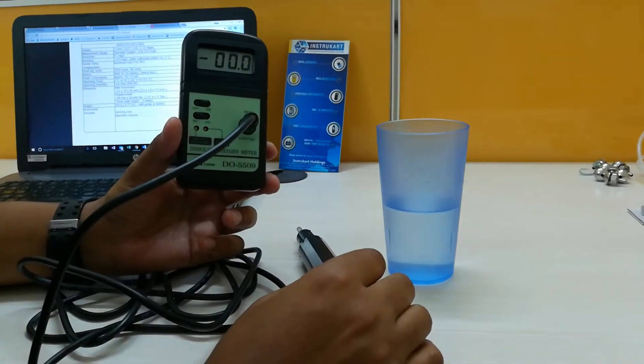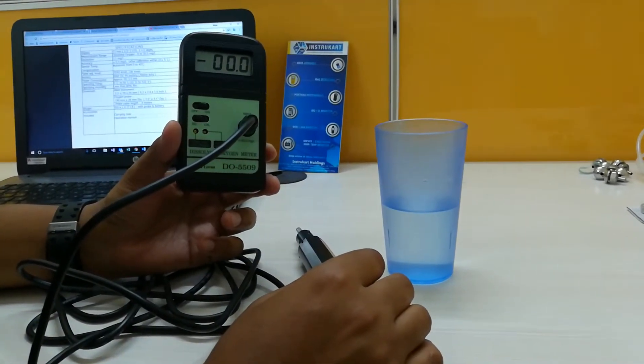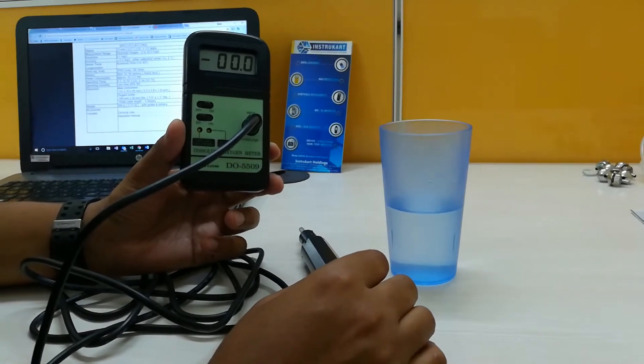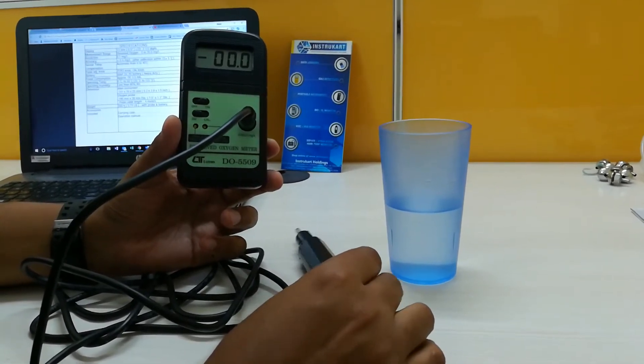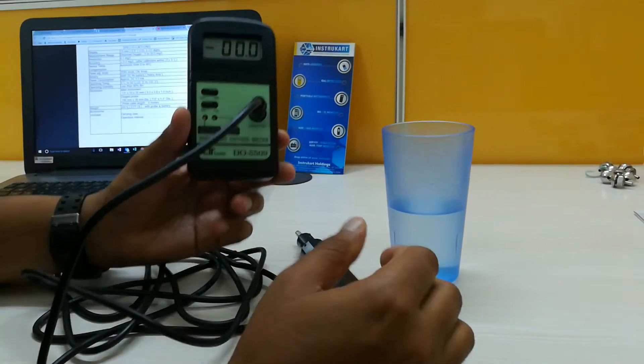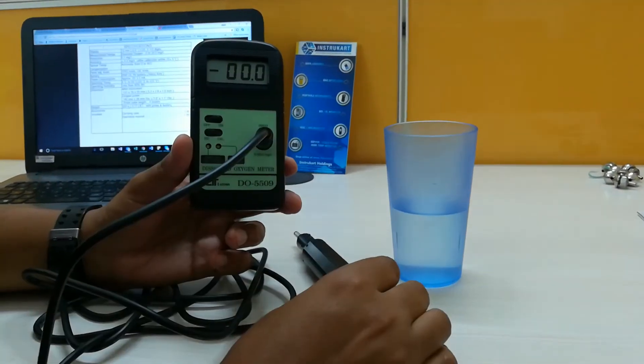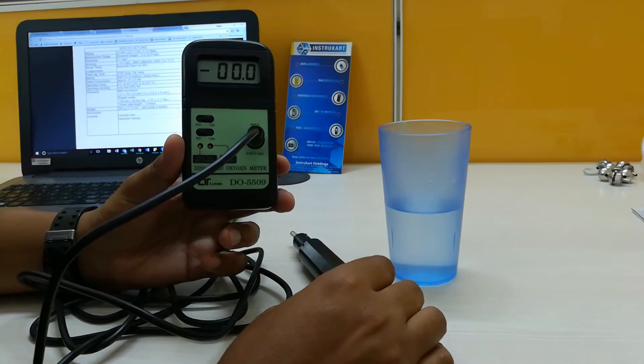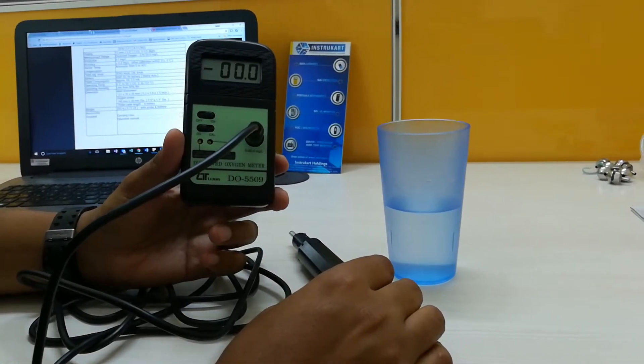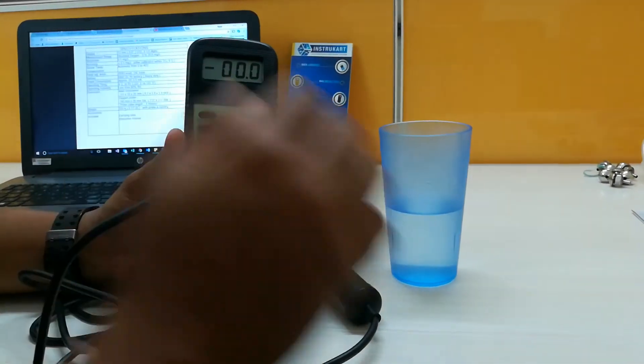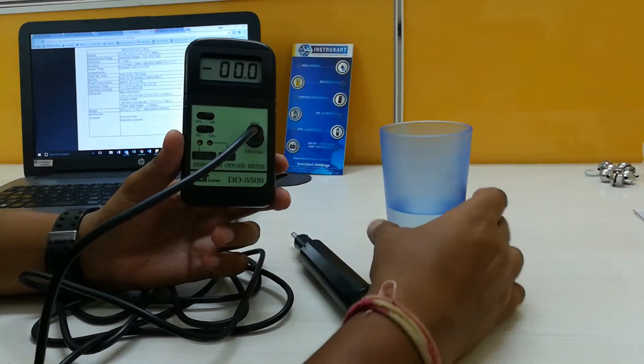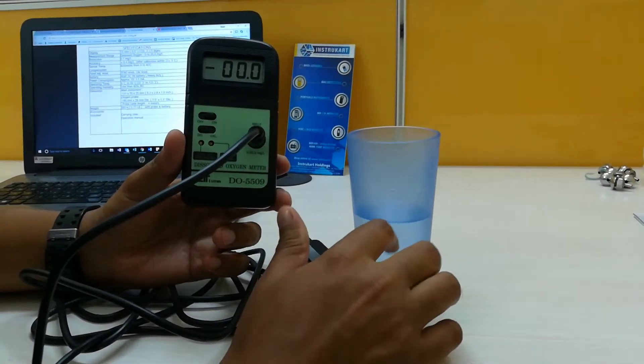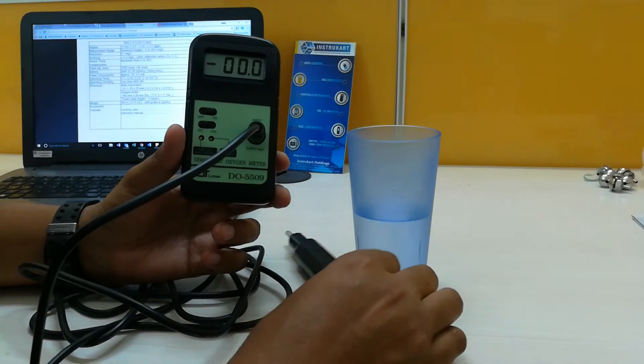The measurement range is 0 to 20 mg per liter. The resolution is 0.1 mg per liter, and the accuracy is plus or minus 0.4 mg per liter. The operating temperature for this is 0 to 50 degrees, which means the water temperature should be 0 to 50.